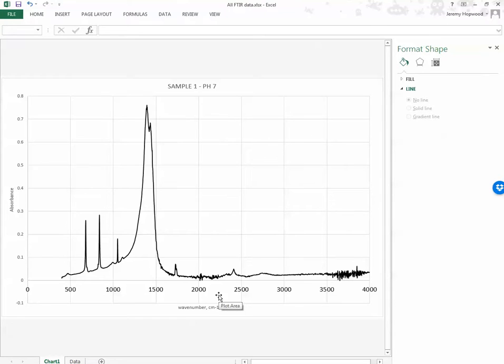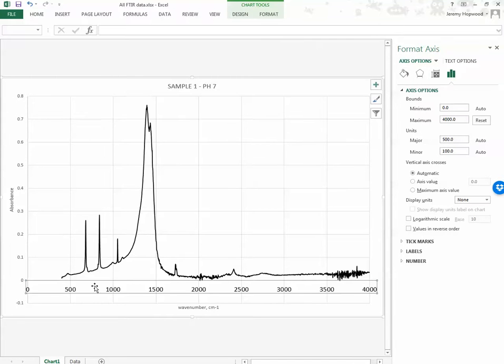So now I've got the bottom scale tidied up a bit, but what you need in all graphs are tick marks. I always go on at students about this, because how can you tell where 600 or 700 is? So you need a tick mark where the 0 is, the 500 and 1000, but in between these numbers you also need tick marks as a guide. So I'm going to left click it again to get the rectangular box, and then over here it's got tick marks. I go down and it says major and minor, got none, so I'm going to put them outside, sticking out, because if you put them inside, the tick marks will appear in the graph, and I prefer them outside. The minor ones we're going to put outside as well. And we haven't specified what the minor ones are, but it's automatically done it for us.